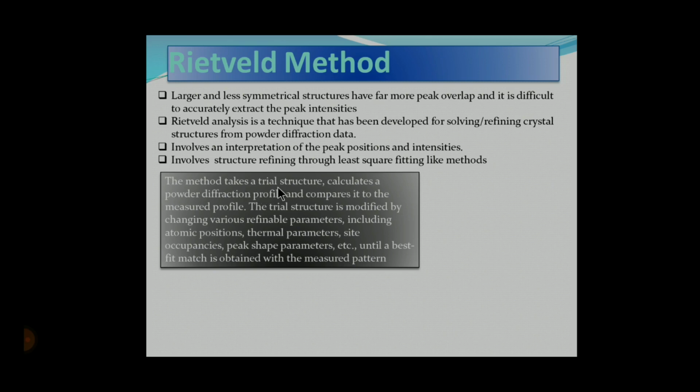Okay, we will be considering a trial structure, which might be a hypothetical one or a standard one. It can be anything. We will be calculating the diffraction profile, because all the parameters will be known for that trial structure, and it compares it to the measured profile.